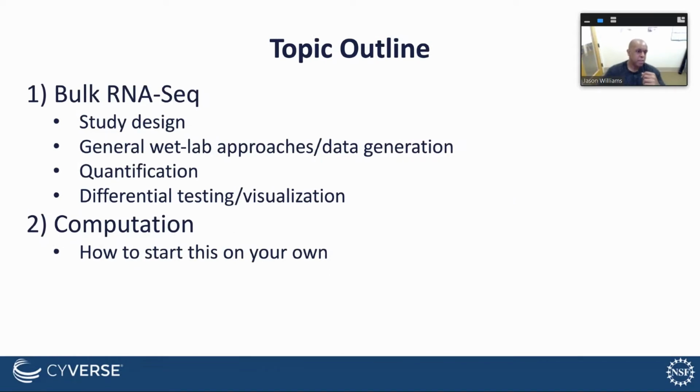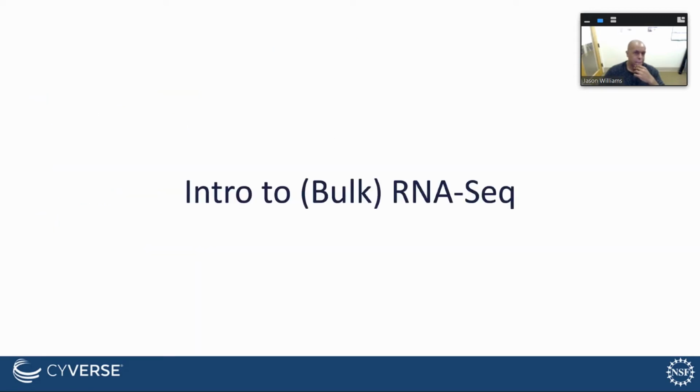Okay, so let's start with these two things, Bulk RNA Seq, and we've got 4 points to cover there, and computation, how to really get this started on your own. We're going to go through this step by step. So, introduction to the Bulk RNA Seq.